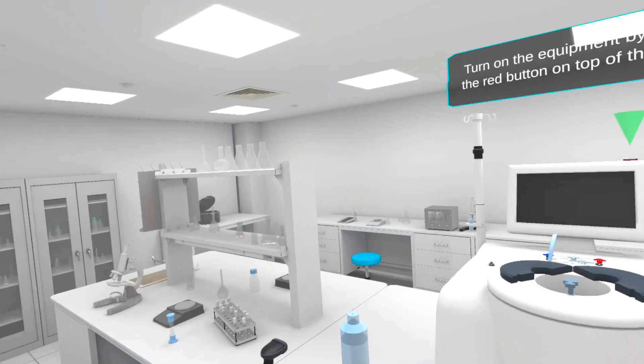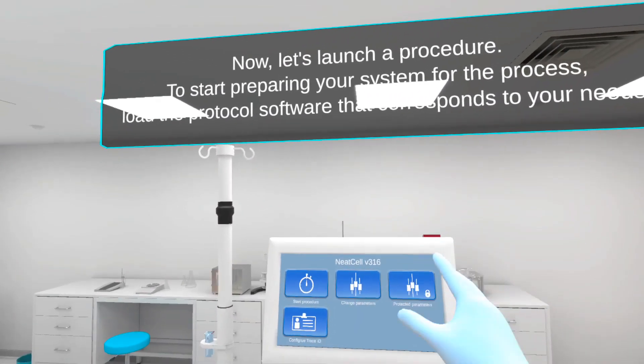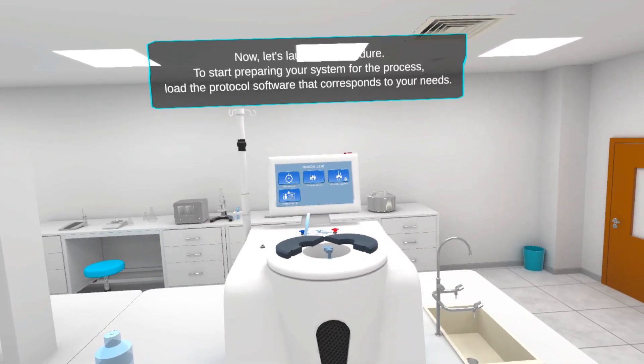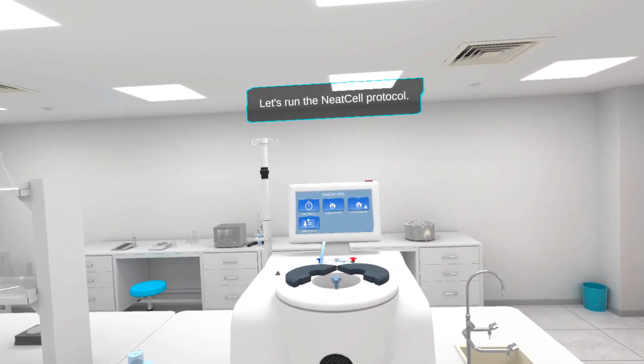Turn on the equipment by pushing the red button on top of the display. Now, let's launch a procedure. To start preparing your system for the process, load the protocol software that corresponds to your needs. Let's run the NeatCell protocol.